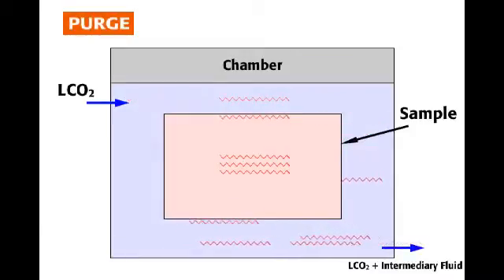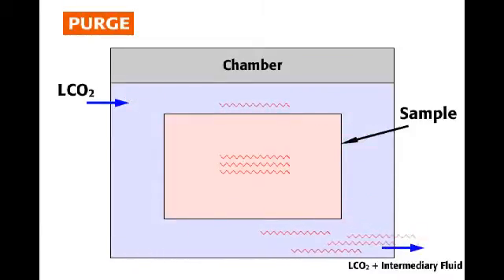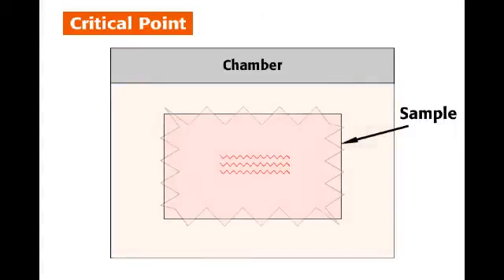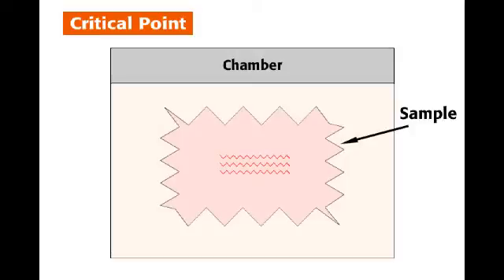During the purge mode, liquid carbon dioxide is pumped into the cooled chamber while the intermediary fluid and liquid carbon dioxide exit through the vent port. The problem with thicker samples is that the intermediary fluid can be exchanged out of the chamber fluid, but can still remain inside of the sample. When the chamber rises above the critical temperature and pressure, the sample structure will collapse due to the internal intermediary fluid still present inside of it, and an incomplete drying will occur.